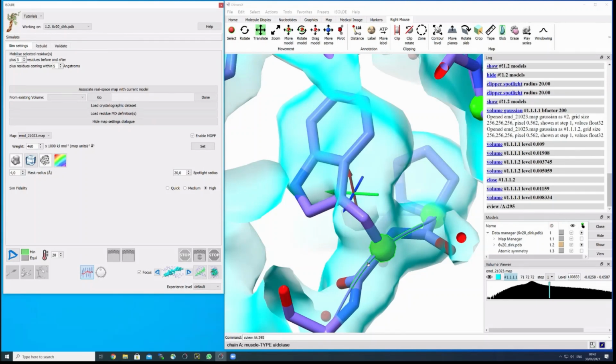And what I will do now first is I will change the temperature, which can be done here. So if this is 20 Kelvins now, this is the new default. You can use 100, you can use 1. It basically means it heats up the temperature of the simulation. So the hotter, the more things will be moving. The lower, the less they will be moving. So I will start now with 1.